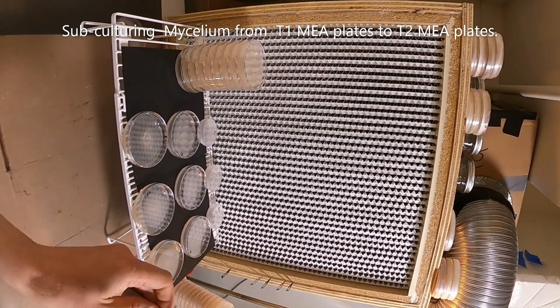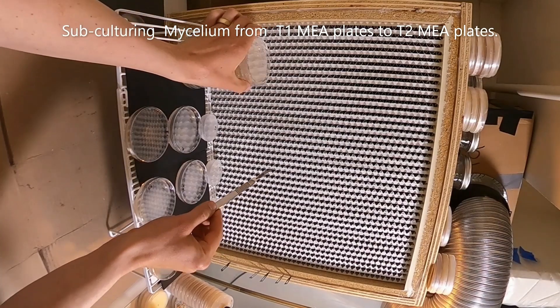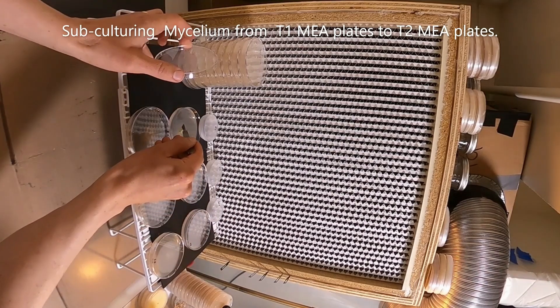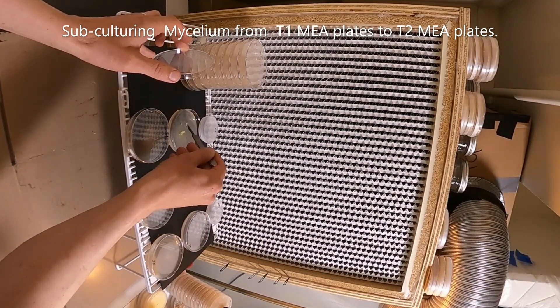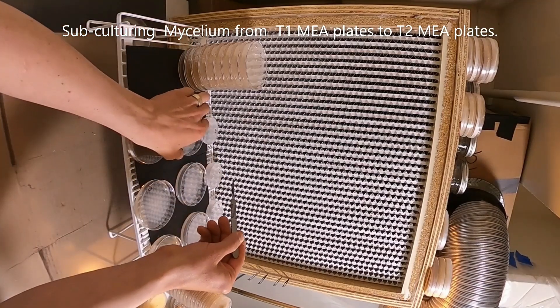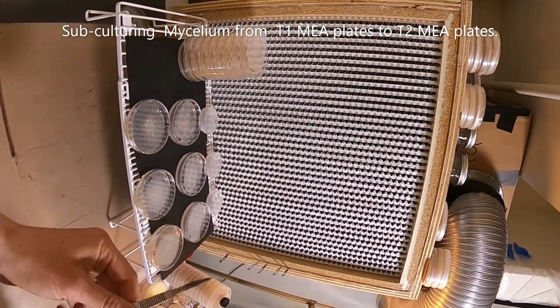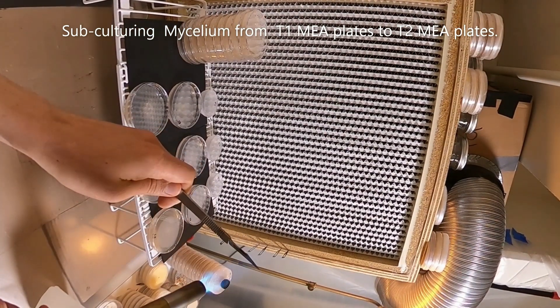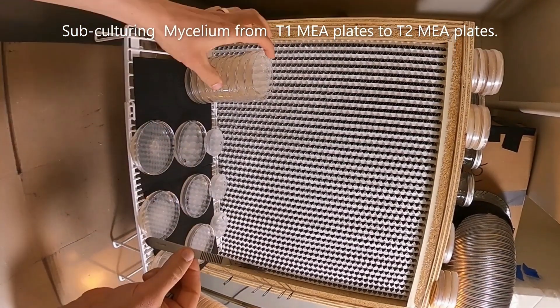I'm going to save one of each. Conceptually, this is all the exact same genetics — I'm just trying to have multiples so that as I go down the road, if one of them contaminates, I'll have backups. So I'm taking some from all of them, even though two plates already looked clean. I'm taking a small sample, putting it on a clean plate, and sterilizing between transfers with my blowtorch.